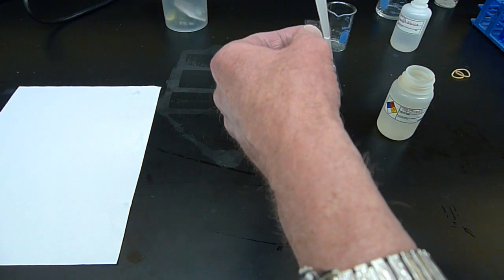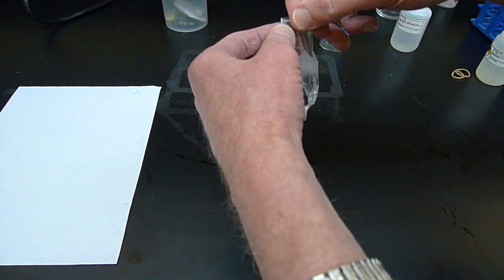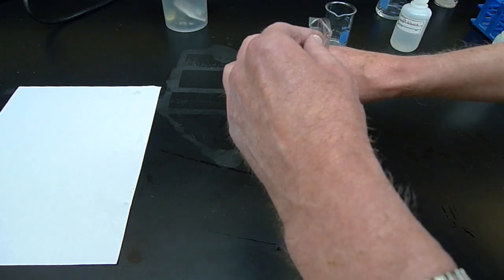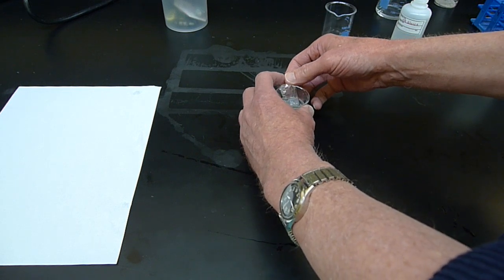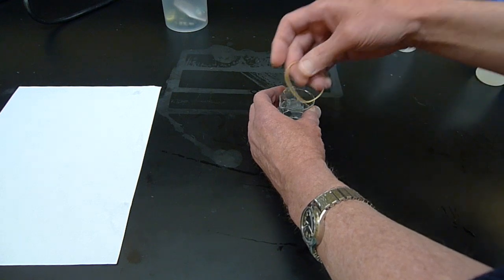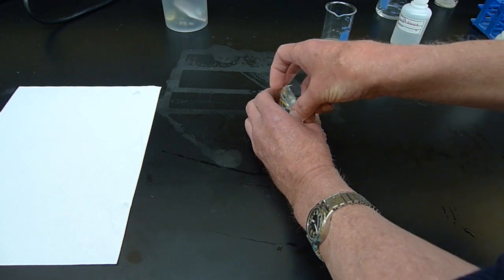The starch, again, is kind of whitish, so that means it will look different. And you can see here the starch and the glucose mixed into this bag. And all I'm going to do is put this bag into the water, a beaker full of water, secure the top here with a rubber band. And so this is going to sit here.